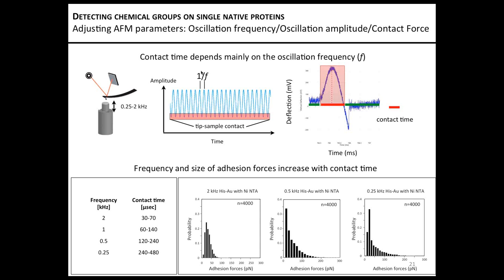After that, the length of the polyethylene glycol is not so important. In some assays that we are performing now, it's a very short linker, less than 20 ethylene glycol units. From my experience, I could also add that typical values like 4, 6 to 20 nanometers are used. But of course, you would like to keep that as small as possible when you're dealing with smaller molecules.